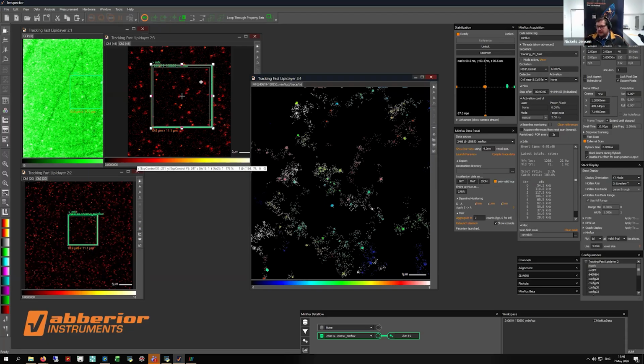In the end, concerning the speed, we are limited by 2 things. One is how fast we can really follow that molecule in the small steps and how fast we can localize, and this has something to do with how fast we can scan. But the other reason is we are also limited by the photon output of our dye, because we have to gather tens of photons, 20 at least, in 100 microseconds, and this means we need a very high photon output of the dye. So for tracking, I always suggest taking bright dyes.